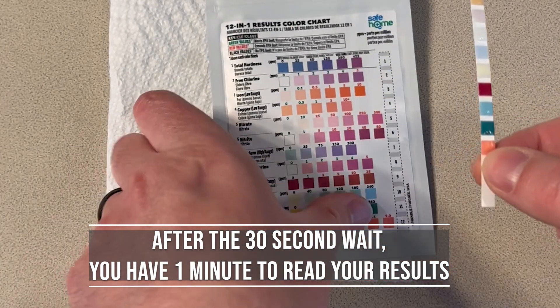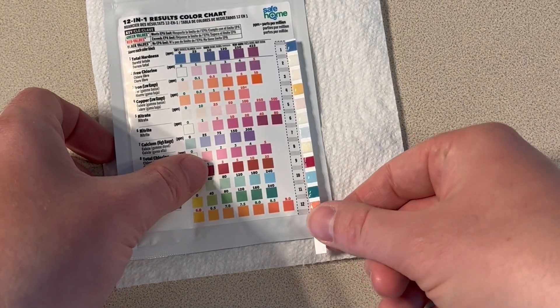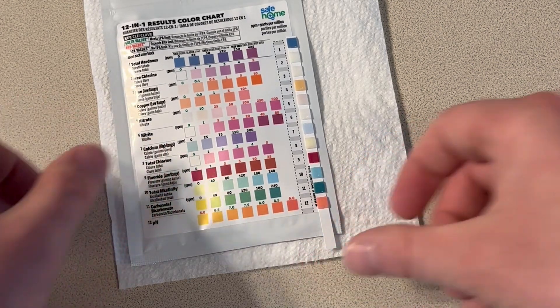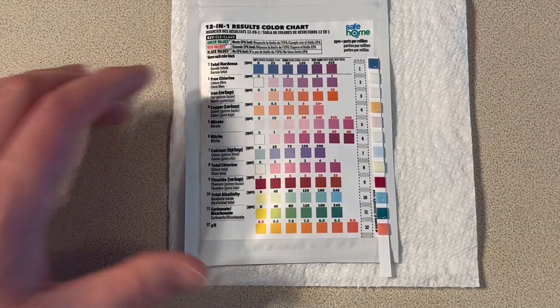After you've waited the 30 seconds, you now have one minute to read your results. You'll take the strip and lay it beside the color chart that's on your pouch, with the handle facing towards the bottom of the pouch. Then you'll look at each pad and find the closest match on the color chart.